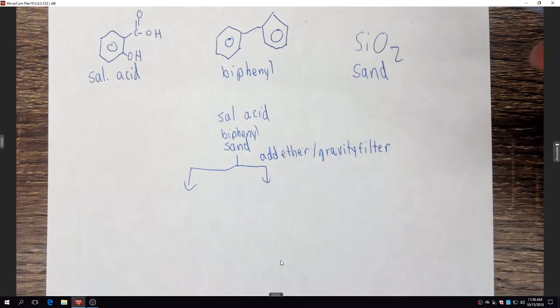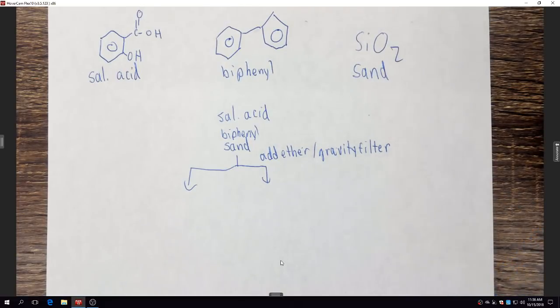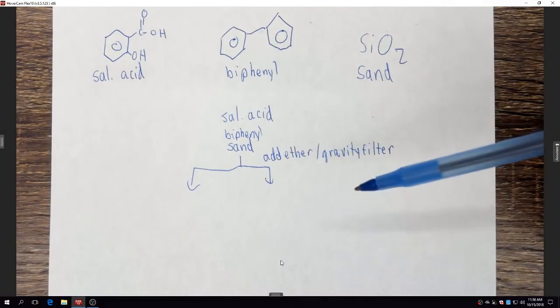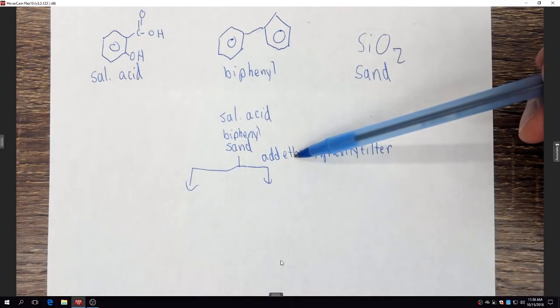Have you ever heard of an exploding meth lab? Do you know what causes meth labs to explode? Ether. Okay, ether is extremely volatile. The boiling point's like 37 degrees. That's roughly the temperature that you are. So ether is super volatile, and in the gas phase, it's explosive.